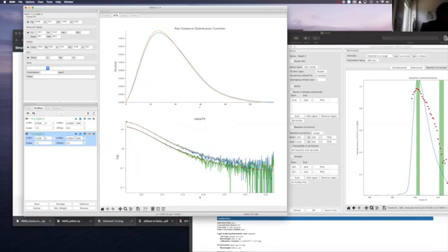But generally speaking, what was recommended was using this deconvolution, so let's try it. I know it's not going to work for this case, because this transient behavior of a monomer-dimer is appearing across the whole elution, so there is not a perfect separation between the monomer and dimer. It's really just a little bit. You can see almost similar P(r) function, almost similar radius of gyration, and only a slightly different molecular weight.